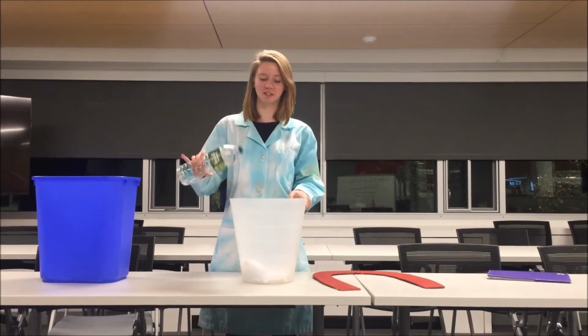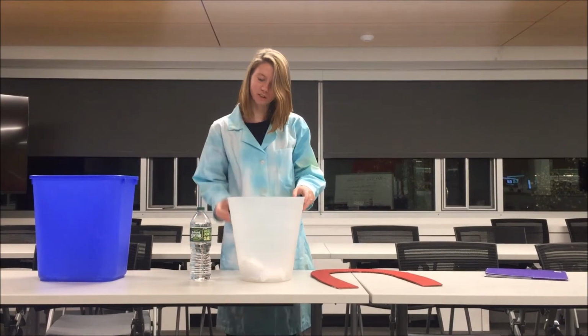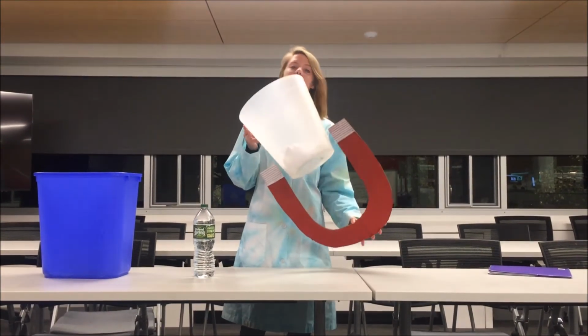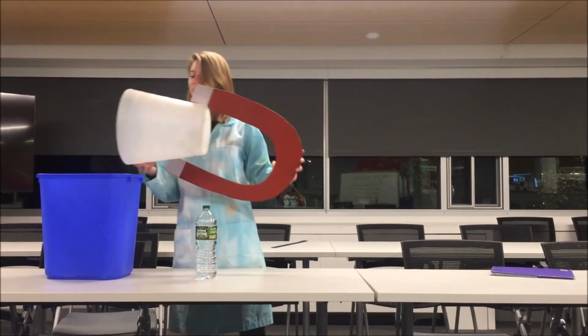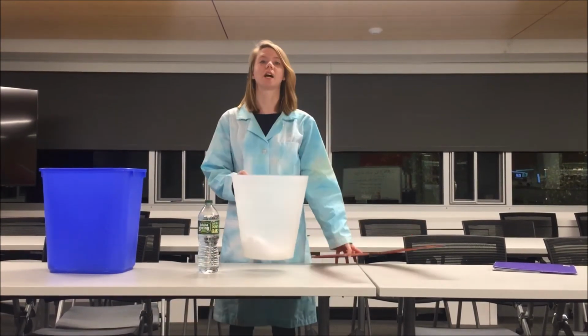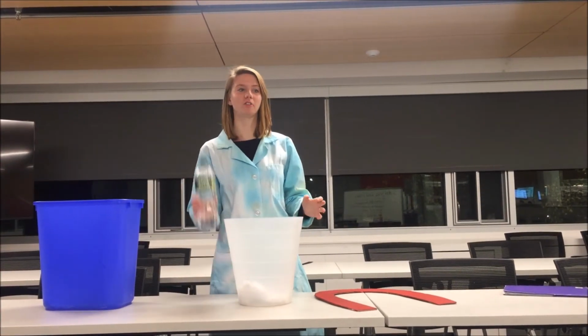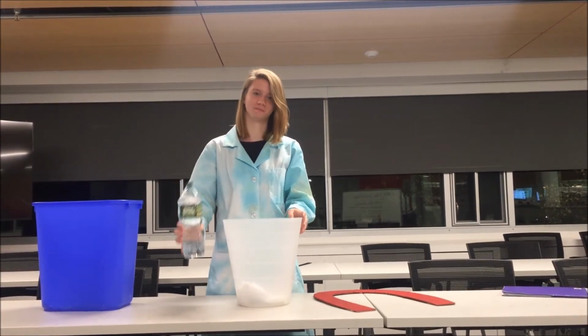We then added 50 milliliters of water, swirling for about a minute to redisperse the nanoparticles. We then used the magnet to keep the nanoparticles at the bottom, pouring off the water. We did this 4 times, removing the water each time. Then, once the nanoparticles were clean, we added 100 ml of water to the final solution.